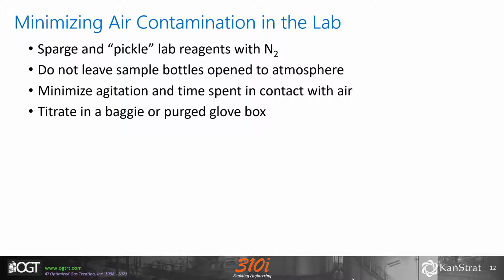You could have made every precaution out in the plant to minimize air contamination, but if that same care is not taken in the lab, the sample may be compromised. One lab that comes to mind, the first step in the testing procedure was to shake the bottle vigorously to ensure a homogeneous solution. Well, if there's any amount of air in the sample bottle headspace, you've now ensured that the air is homogeneously contacting the acid gas.